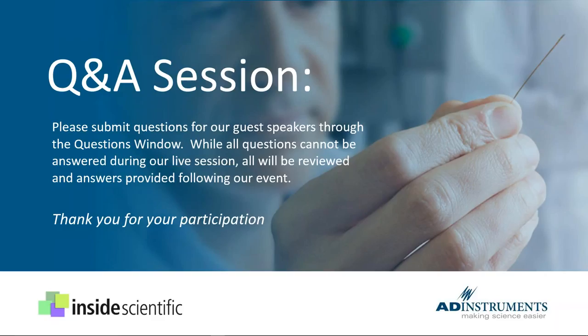Yes. And actually, an extension of this, I'm curious. Is it also correct that each segment is set up as, or at least can be set up as, an independent trace in your data acquisition software? So is it fair to say, if segment one, for instance, proved to be a bit noisy and you didn't want it included in your final volume calibration, that's something someone could decide post hoc? So is it fair to say, record as many as possible and then look at the active segments you'd like to use for analysis post hoc, so that you don't turn something off and not have anything recorded from it, I guess is what I'm saying?